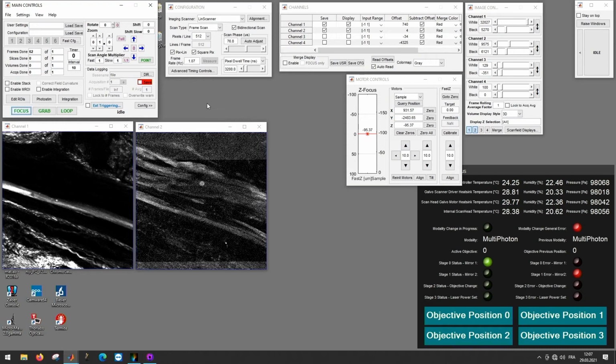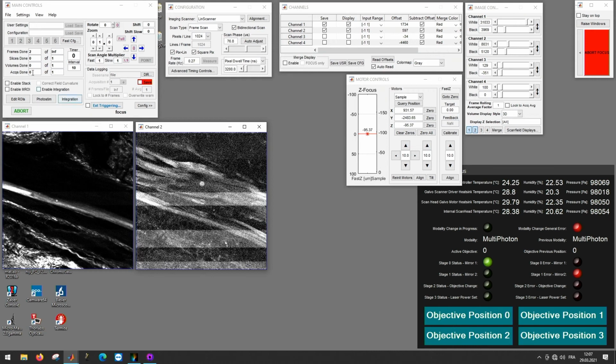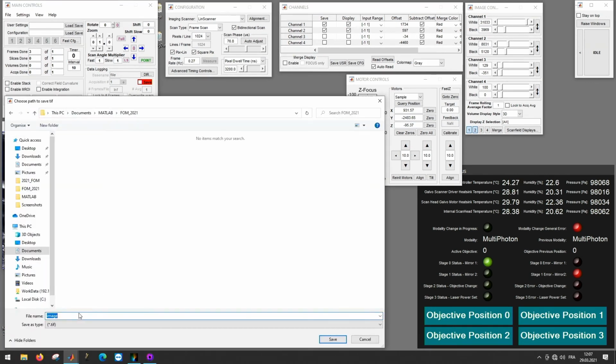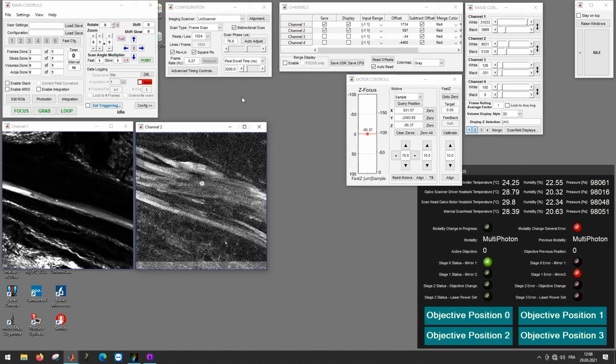I can stop the live mode, and then we will increase the resolution and start the imaging process again, so that we have high resolution images, of course. Just auto scale this a little bit and stop the acquisition. Then we can save this image also as TIFF files. This one is the SHG at 520, and this one is the two photon image at 595. Save them.